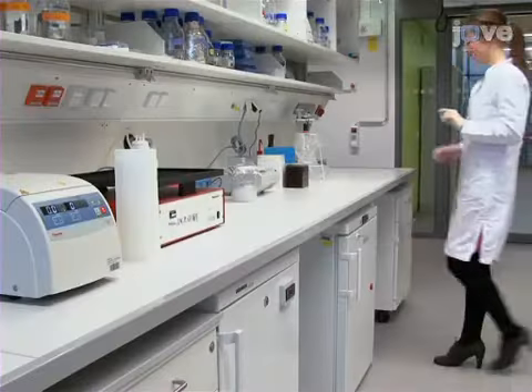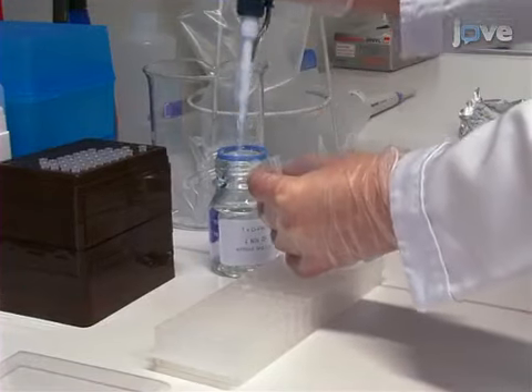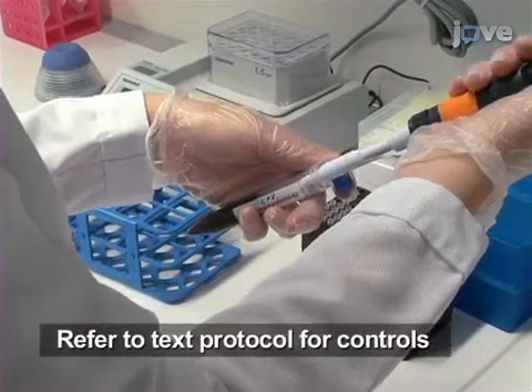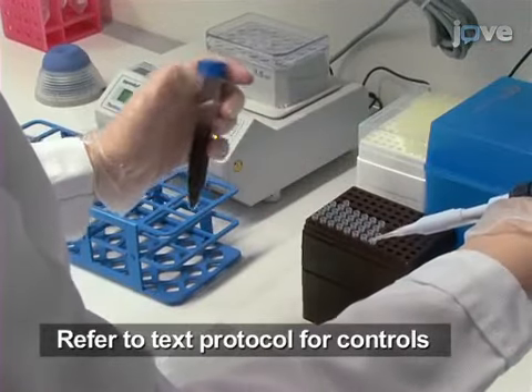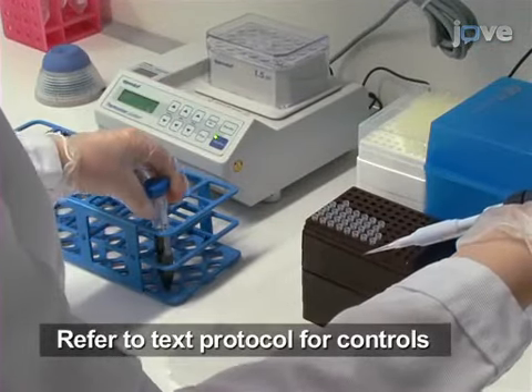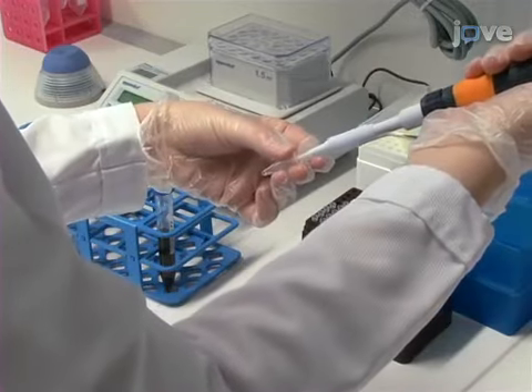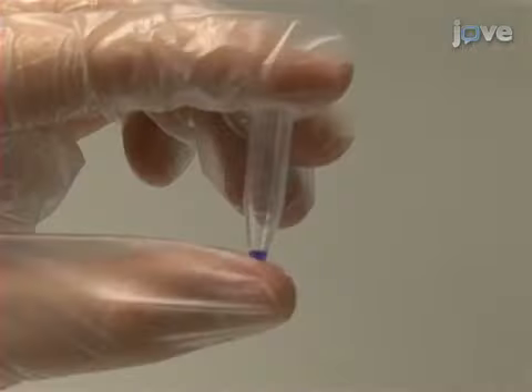To prepare the injection mixture, begin by making a 500 micromolar morpholino stock solution using PBS. For 10 injections, prepare 10 microliters of injection mix by combining 9 microliters of diluted or undiluted morpholino solution with 1 microliter of a fluorescent tracking dye. Store at room temperature.